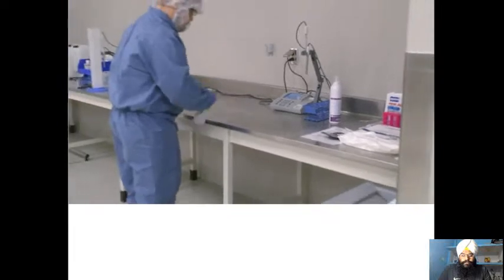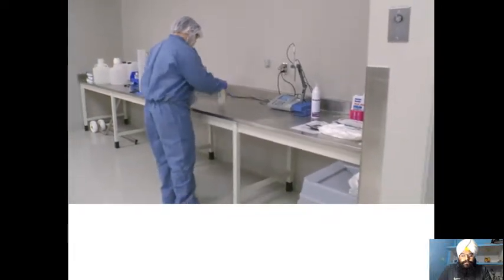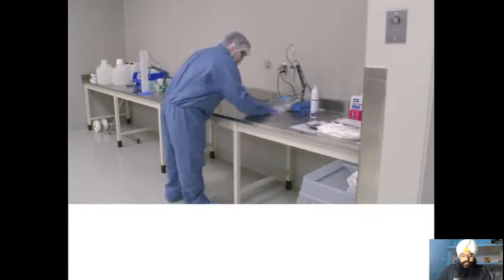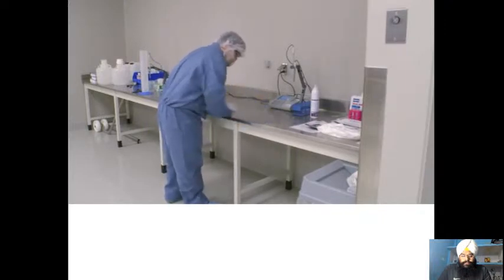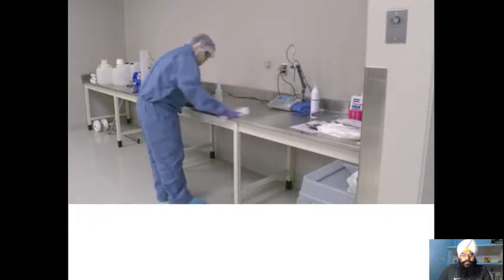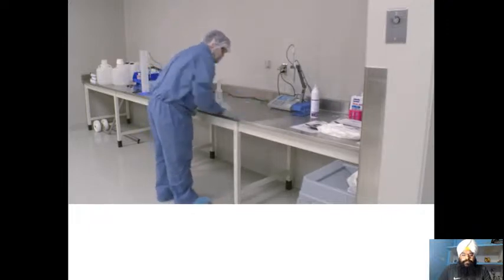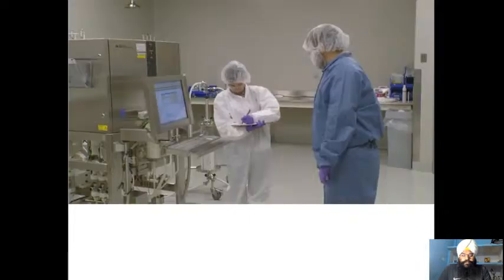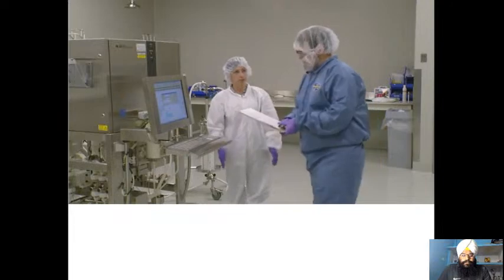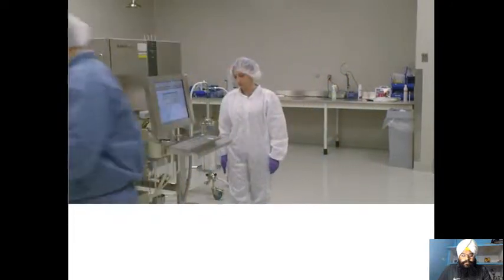Before the process can begin, the purification area must be cleaned, disinfected, and organized. Any unnecessary equipment or materials are removed. All equipment must be cleaned, sanitized, and set up as required by standard operating procedures. All required materials and documentation must be gathered and prepared before the process may begin.